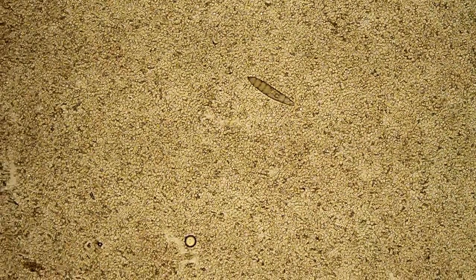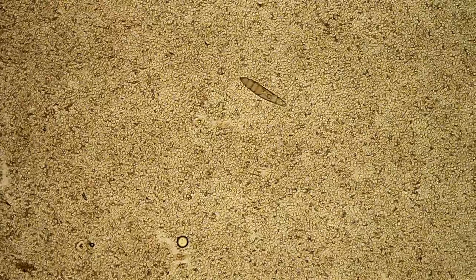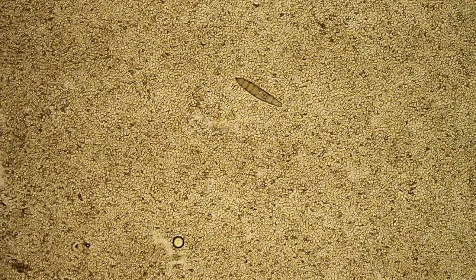Focus in. There. Let's see, I don't know what that is. I've seen these before in water samples. Can't believe that came out of his blood though.